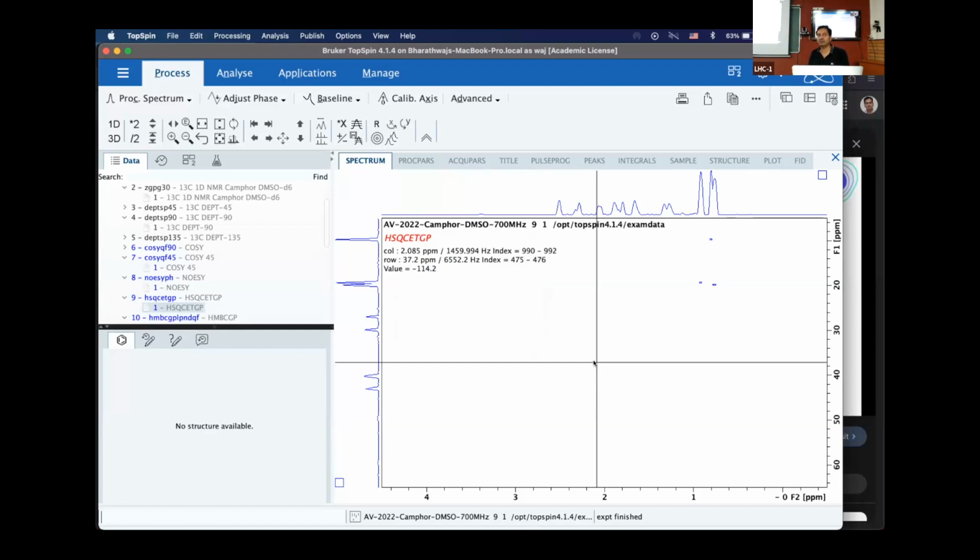That's it. The question is, how do you end up transferring polarization, and how many chemical shift labelings will you do? Maybe if you have an HCN, you will label the nitrogen, you label the carbon, and you'll come back to the proton and detect and actually correlate the HCN. Only when you have the HCN bond, you will get a peak. That's a 3D experiment. That's about it.